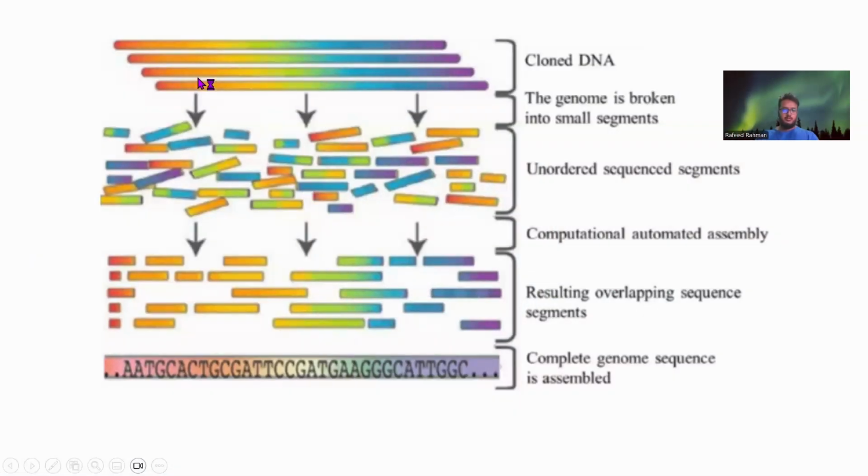So first of all, let's understand a high-level overview of the sequencing process. Suppose you have some human, maybe it's me, and this is my DNA, right? And I want to sequence the DNA. So what does sequencing mean? Sequencing means to be able to read the whole DNA from start to end, right? And this is not possible at a stretch because current tools are not efficient enough or accurate enough to actually read the whole DNA in one go, right?